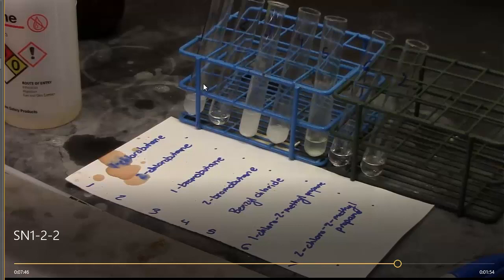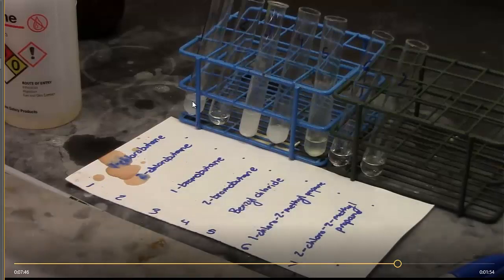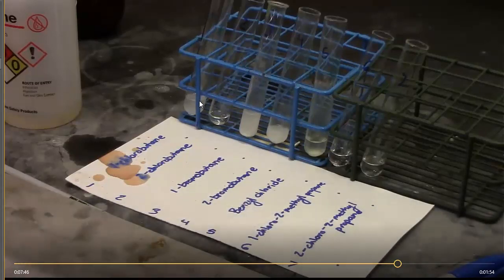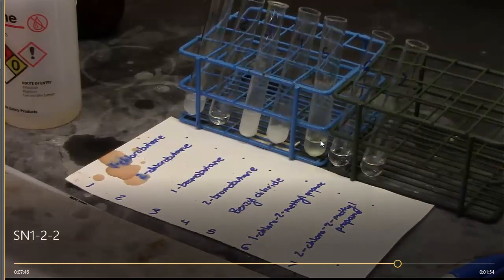And then it looks like our 1-chlorobutane was the last to go of things that we can clearly see precipitate, and that was essentially still not enough to necessarily say. So I would say 20 minutes for that got us pretty close to where these were when we called those an end time. So again, we'll say that the 1-chlorobutane formed precipitate after 20 minutes on the hot bath.